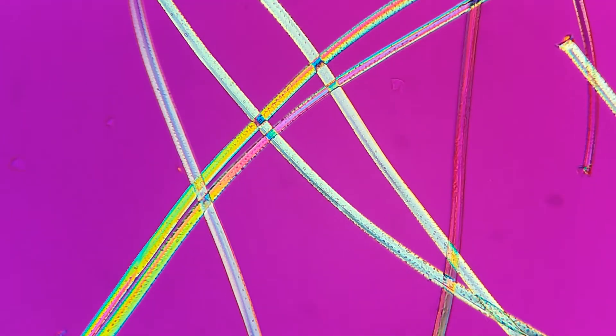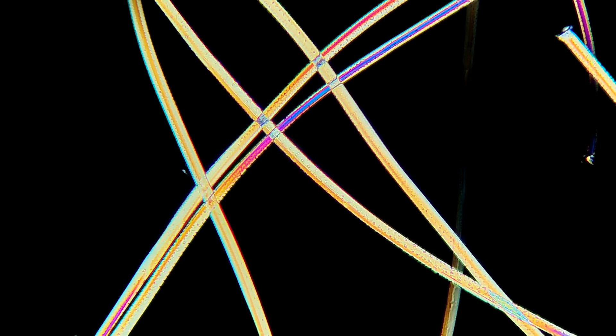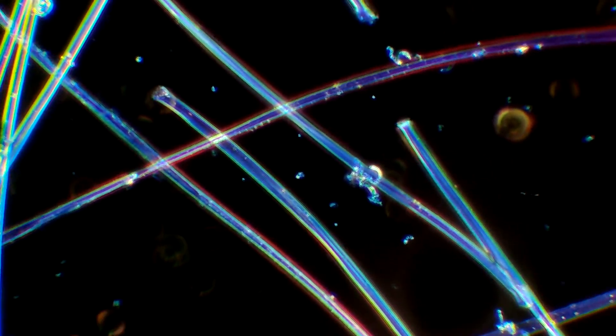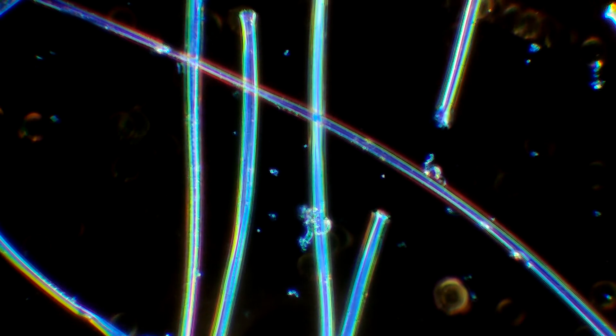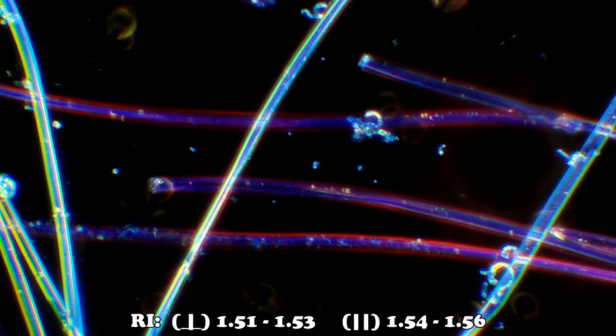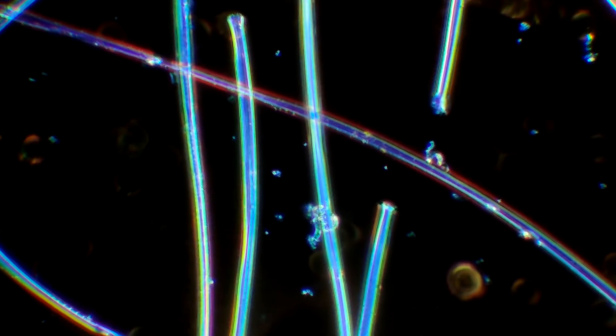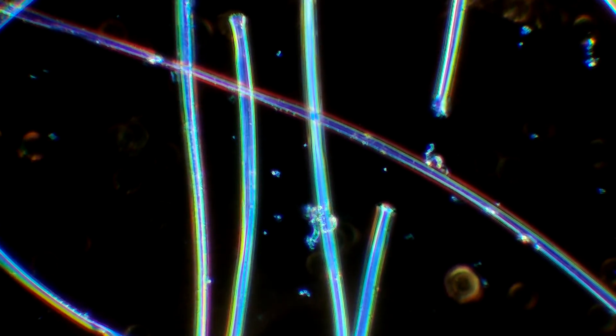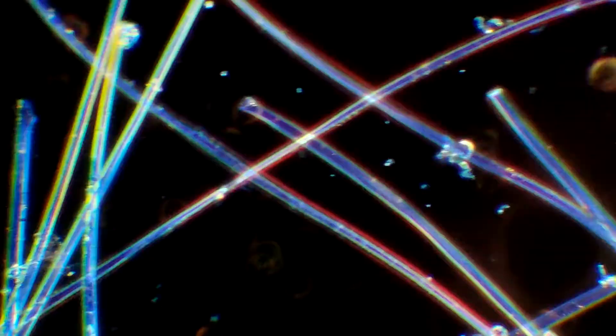Rayon exhibits a positive sign of elongation and uniform extinction. The fibers can periodically appear to have a grainy or finely pitted surface. Under central stop dispersion staining in 1-5-5 refractive index liquid, rayon often exhibits a blue-white to blue-green dispersion staining color in the perpendicular orientation, and blue-magenta in the parallel.